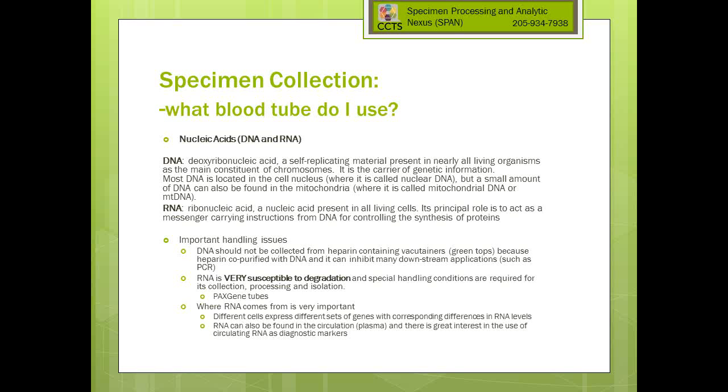That's a lot of different types of cells, and so I want to separate those out and do different things to them. So if I want to get RNA from those, which we sometimes do, time is important, and you need to work those cells up as quickly as possible and get them lysed into something that will stabilize that RNA. DNA tends to be much more stable.